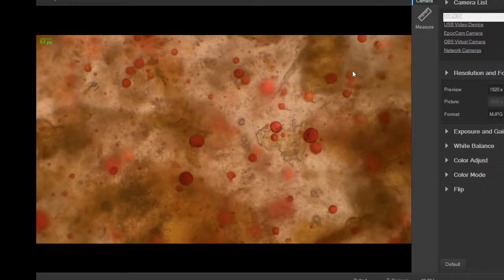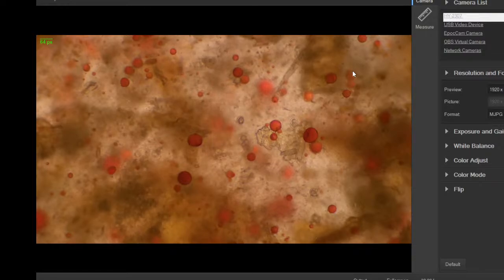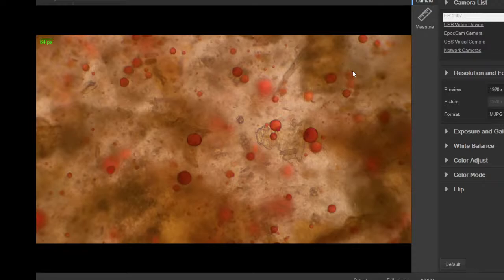Another beautiful shot. More bio art. There's a little bit of movement in the background. Some particles sorting themselves out. Diffusion. Not too much though. I'll have to zoom in on some of it because it's pretty small. A couple oil droplets are moving. That's fun.